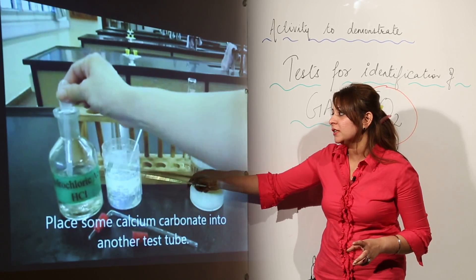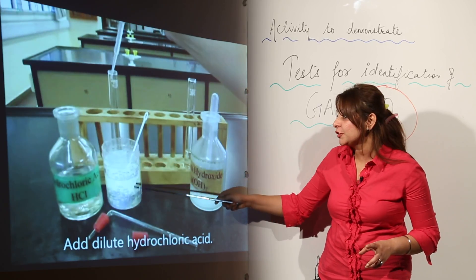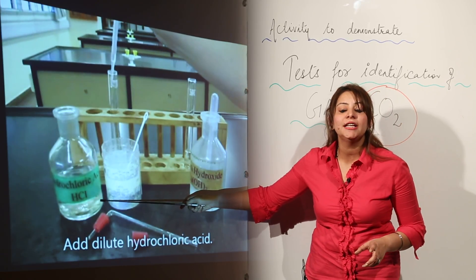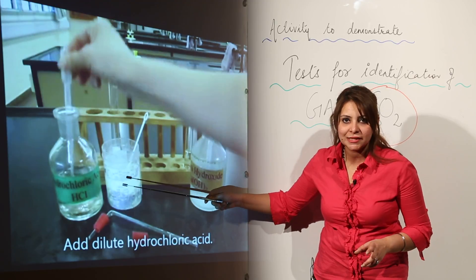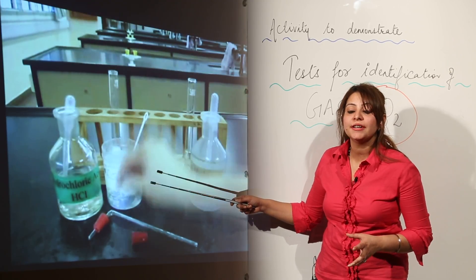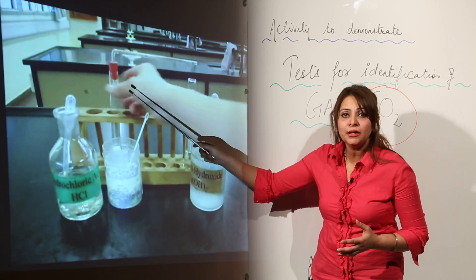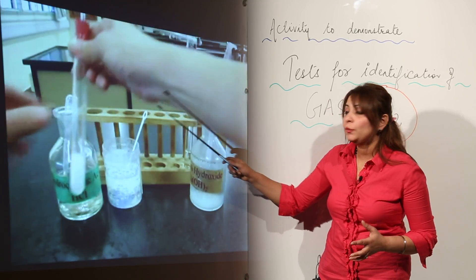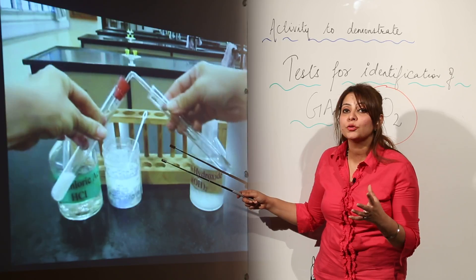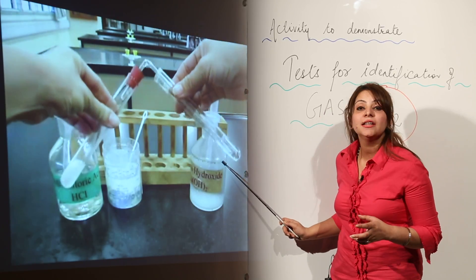What we are doing is adding calcium carbonate and mixing it with dilute HCl, because calcium carbonate when it reacts with HCl it liberates carbon dioxide gas. We are fixing the funnel so that we can collect the carbon dioxide gas and supply it to the next test tube.